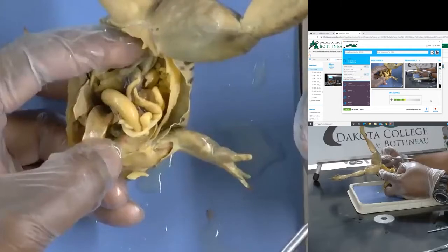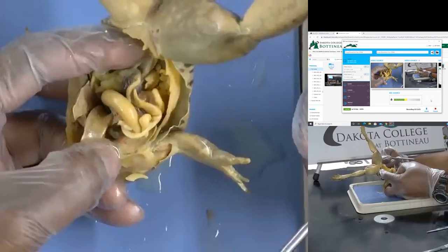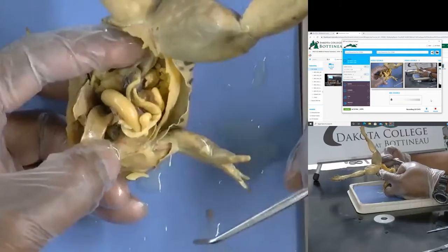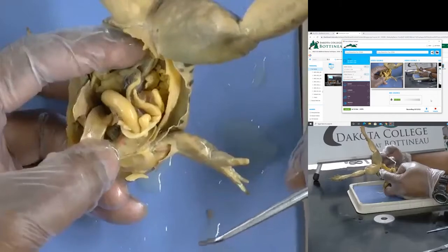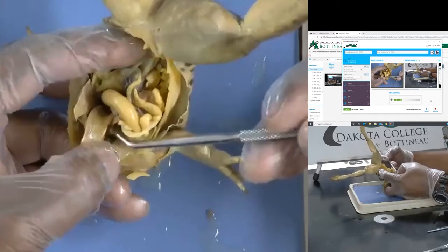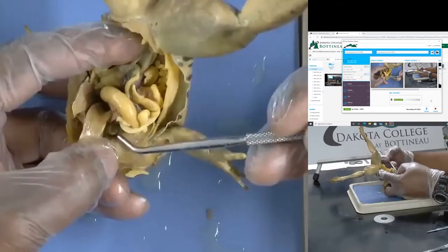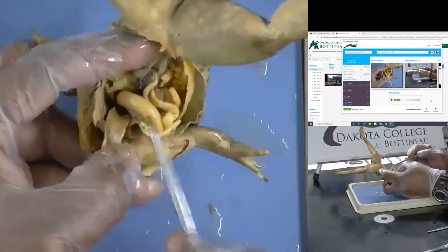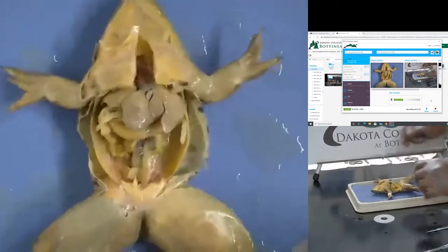They emulsify fat. So when fat is eaten, your bile makes a layer around it, and it helps digest that enclosed fat. It's called a micelle, and in that process bile emulsifies and helps digest fat. So that's your gallbladder, your liver, and right there is your stomach. Okay, I'll turn it around and place it the right way.